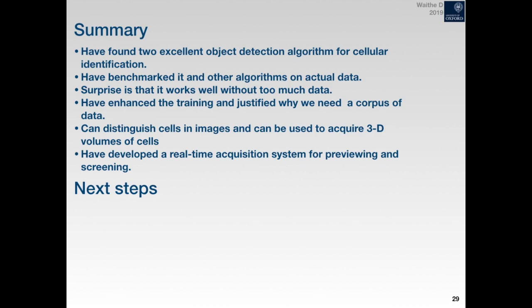That will be a Linux-based Python control algorithm, and you'll be able to set up using our GitHub account very easily and run your own microscope with it. The only problem is that it is an ARM-based chip, which means that some of the hardware drivers that you have on a PC won't work on it, so you have to be quite selective with which cameras and which stages you buy. It's not a plug-and-play system, but if you design your system now, then you could make it fully compatible and have an automated control system for £100 or something like that.